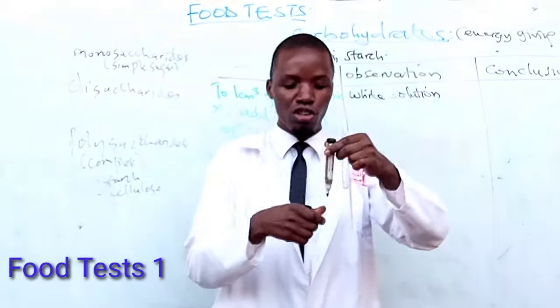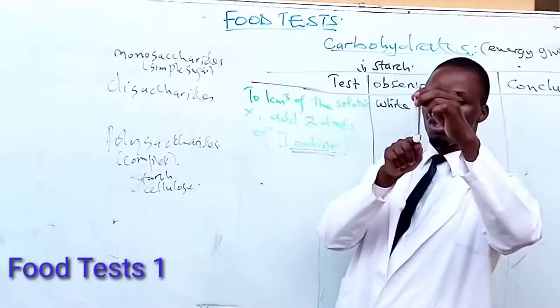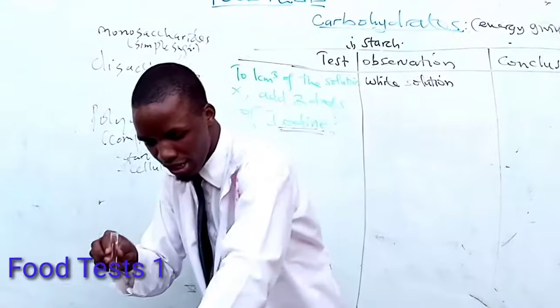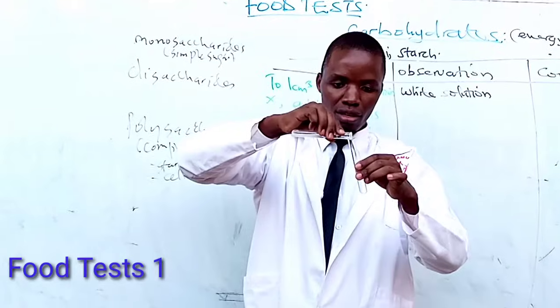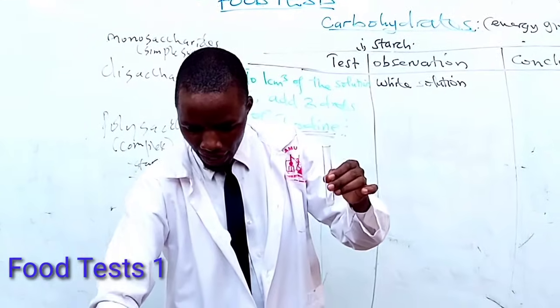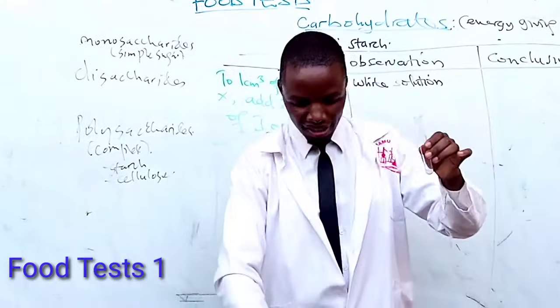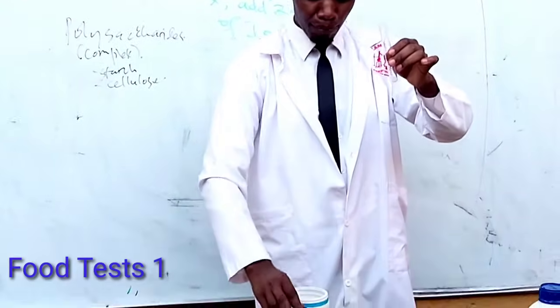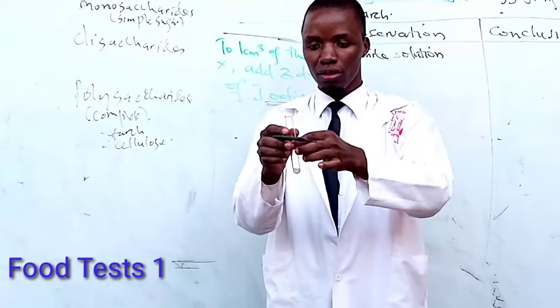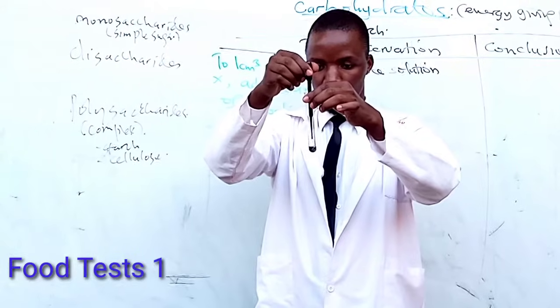This white solution will be my Solution X. From this solution I'm going to pick one centimeter — a small sample. Then I add three drops of iodine. My iodine is here. I pick three drops and add them to the solution. Please take note of what happens. I add three drops — one, two, three.